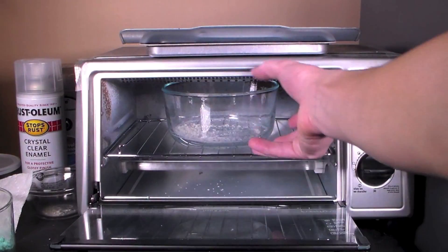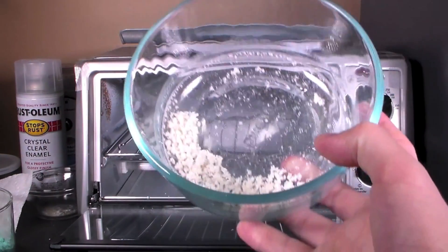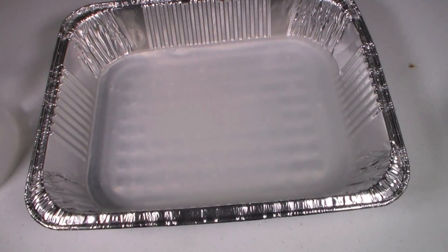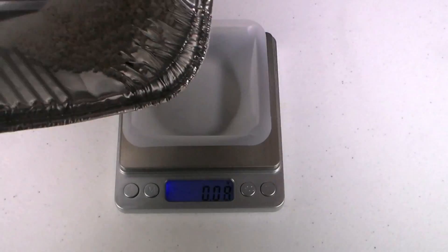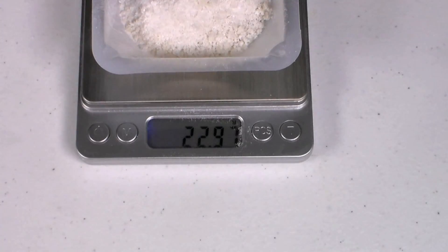After a couple of hours, we have a nice dry aluminum oxide powder. I weighed this and found it to be about 5 grams. As for the rest of the aluminum oxide, this was left in an aluminum tray for a couple of weeks until it completely evaporated. However, when I weighed this, the mass was almost 23 grams.